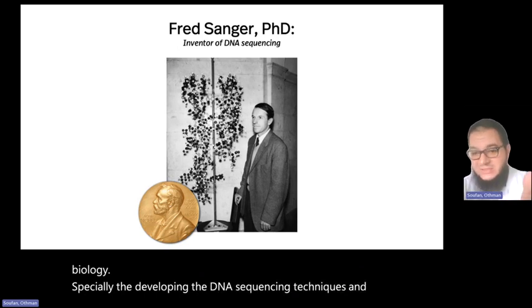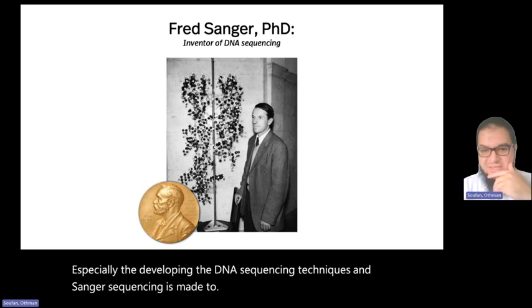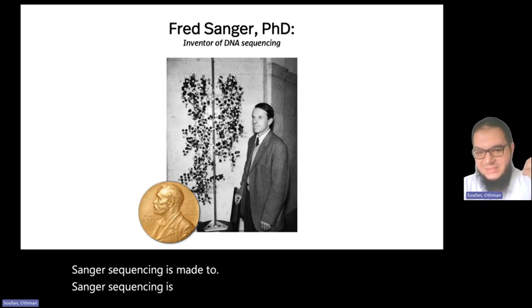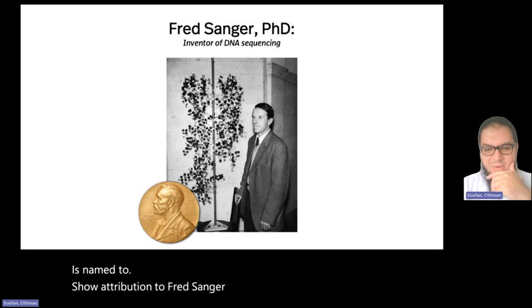Sanger sequencing is named to show attribution to Fred Sanger, which we are going to learn about today.